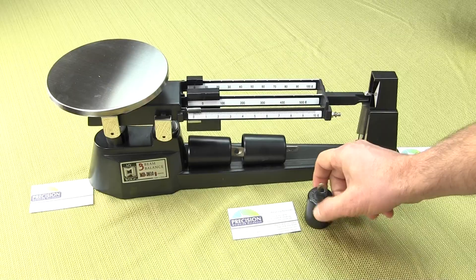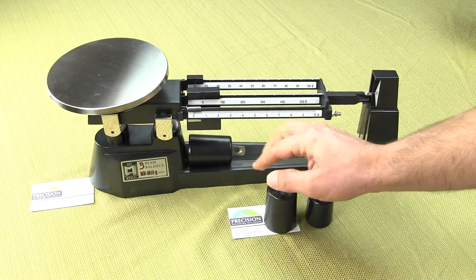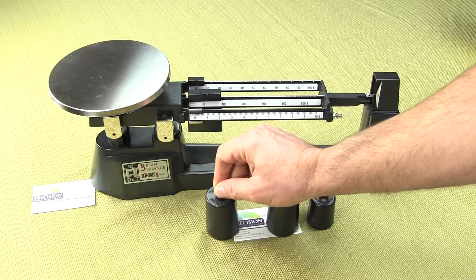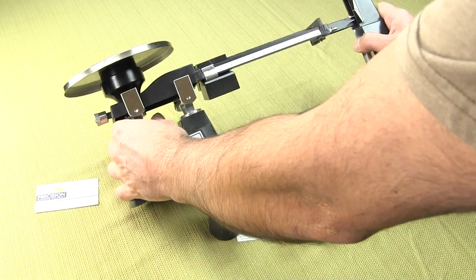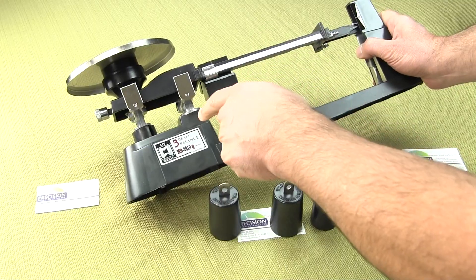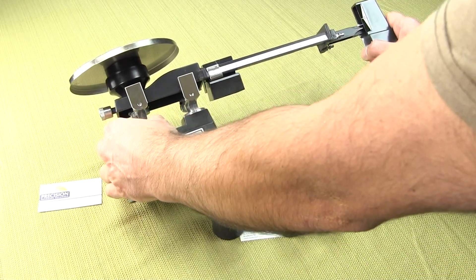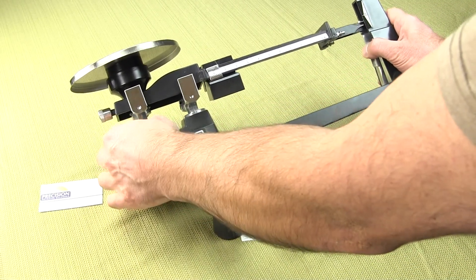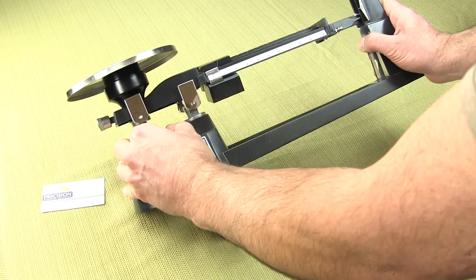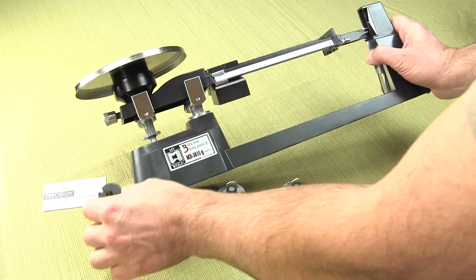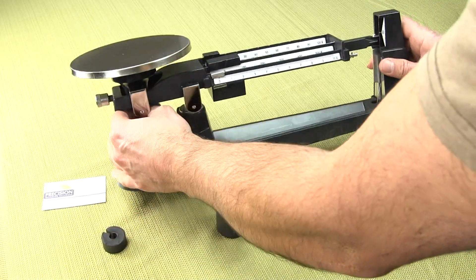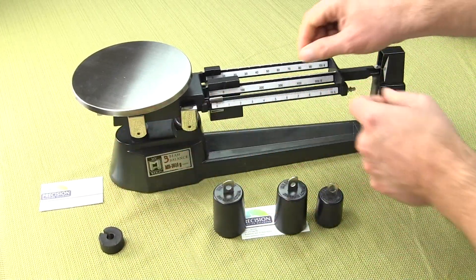When the triple beam balance comes to you delivered, there is a rubber grommet that needs to be removed before using the balance. So underneath the weighing platform, there's this rubber grommet right here. We're going to remove it. This just comes out. This is for packing only so the balance doesn't toggle up and down during transit.